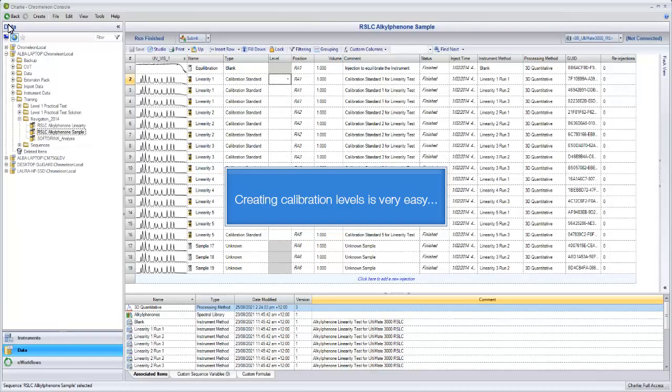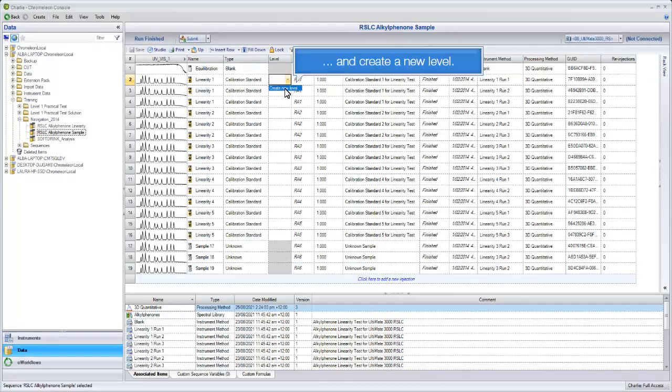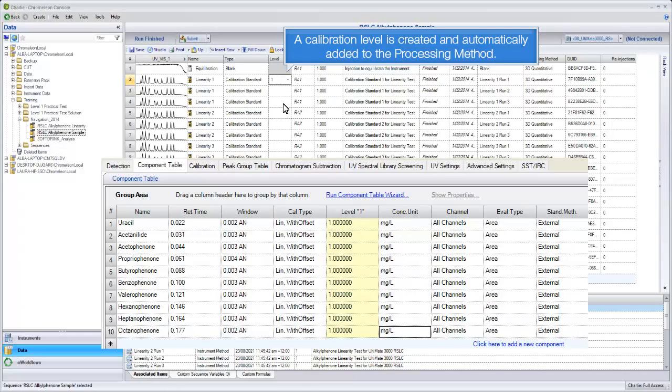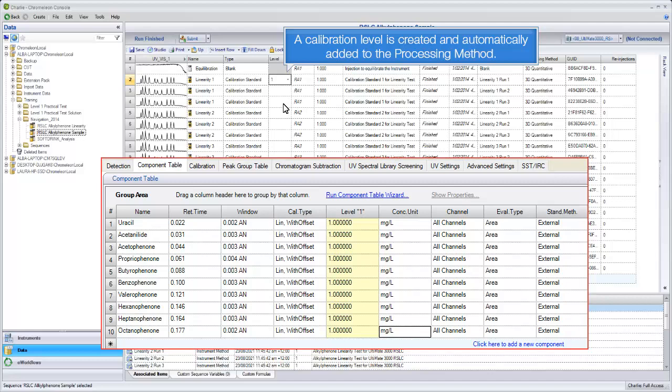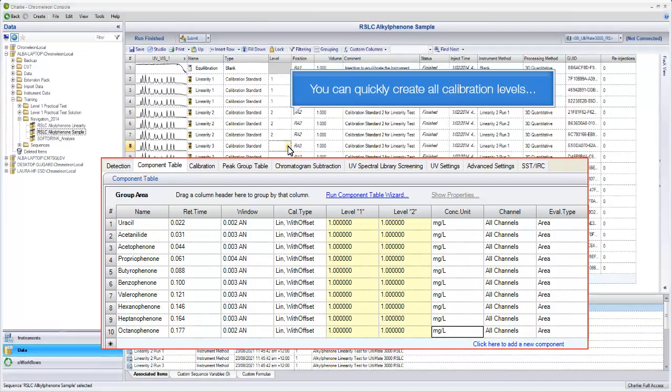Creating calibration levels is very easy. Just select the level column and create a new level. A calibration level is created and automatically added to the processing method. You can quickly create all calibration levels.